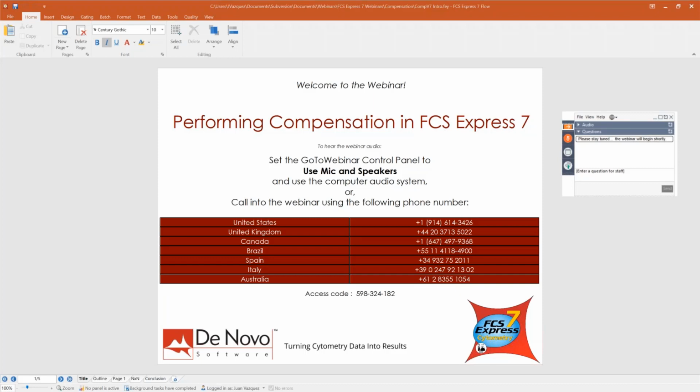Today's webinar is going to focus on performing compensation in FCS Express 7. I'm sure a lot of you have different questions about compensation in general or compensation specifically in FCS Express. I am joined on the line today by my colleague, Kaya Ghosh. So if you have any questions, please feel free to enter them into the questions section of the GoToWebinar control panel, and we'll try to answer them as we go along or at the end of the webinar.